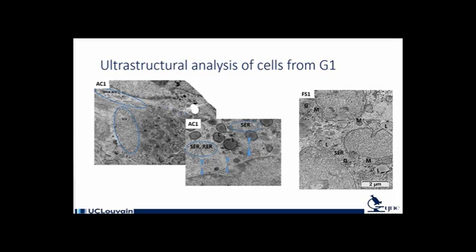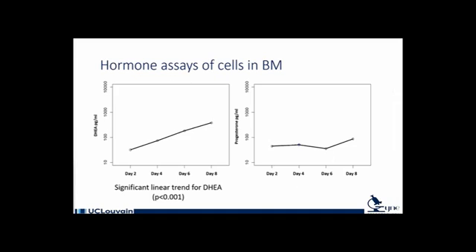How do these cells look through TEM? Well, we observe round and elongated mitochondria and gap junctions between cells in AC1, while cells in FS1 had only round mitochondria. In both AC1 and FS1, some endoplasmic reticulum and lipid droplets were detected in examined cells, which is an indication of hormone synthesis.